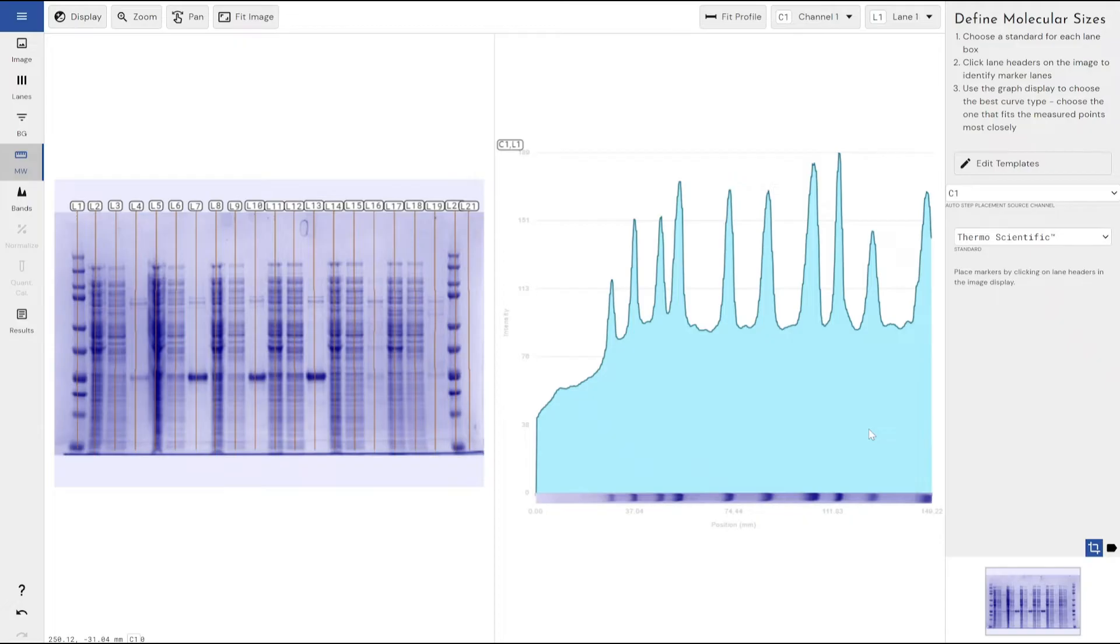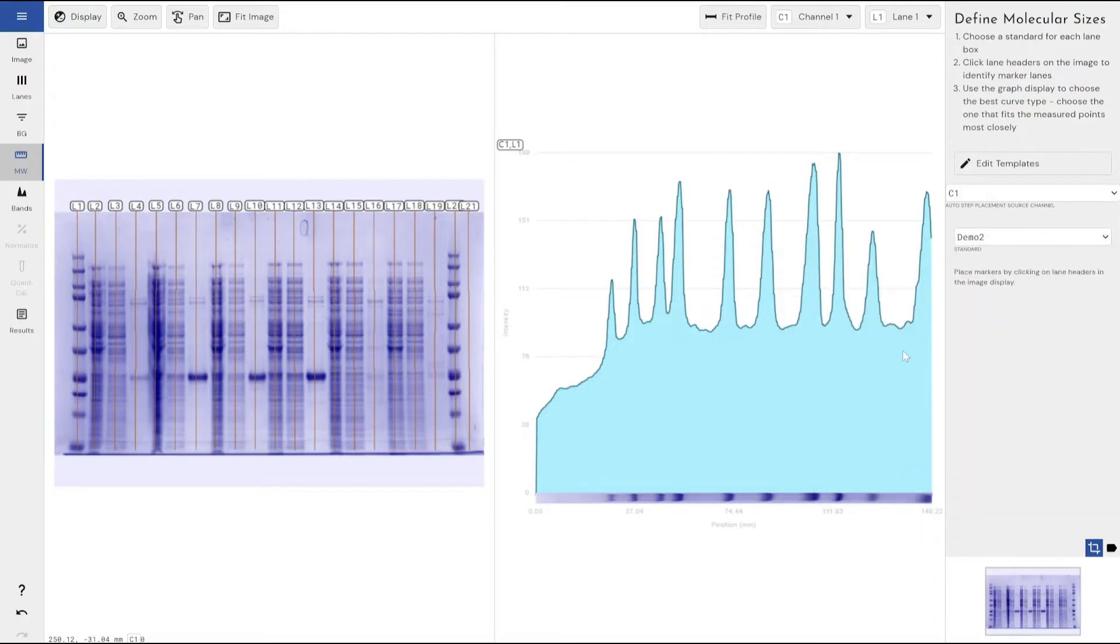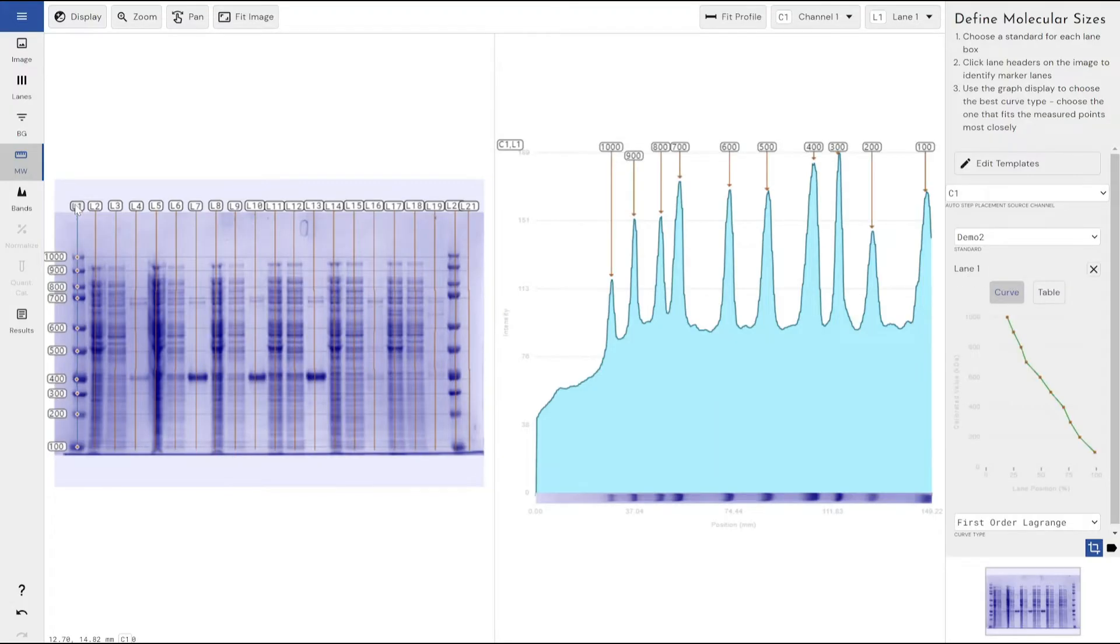I've saved that as my demo 2, select my standard demo 2 that I've just created, and then if I left click on the lane label that I want to use, that I want to apply this molecular weight ladder to, you can see that it's just automatically applied it to that lane.